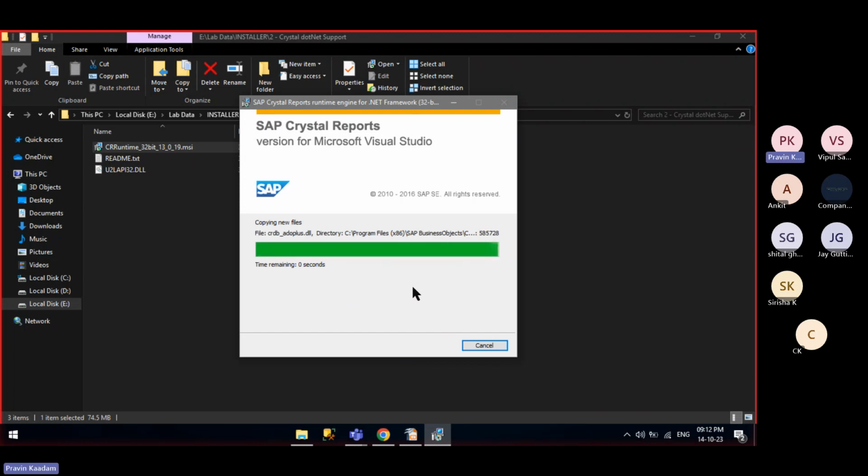So good thing you want to learn LabWare LIMS, because in LabWare LIMS all the reports are configured and designed in Crystal Reports. I have worked with people who are engaged in only designing Crystal Reports, not just for LabWare LIMS, but also for SAP.